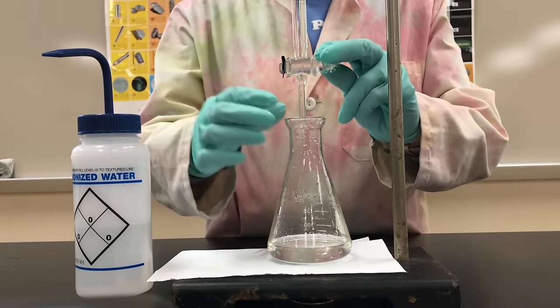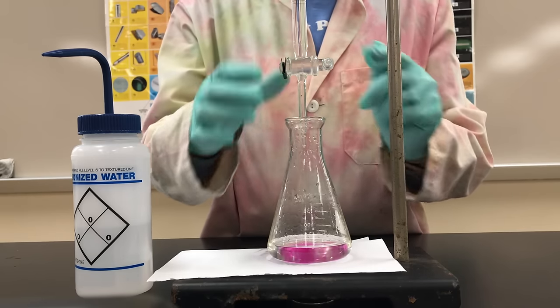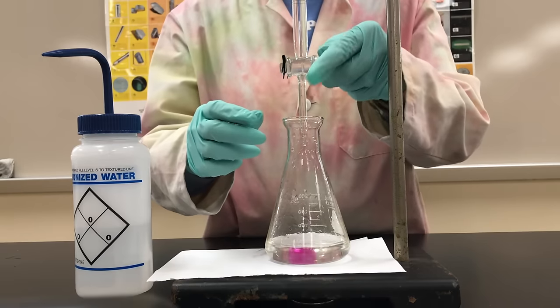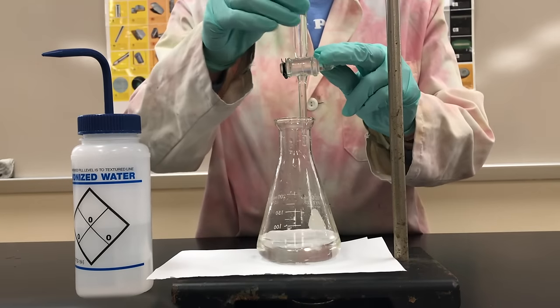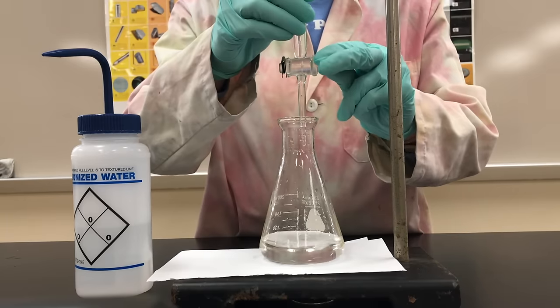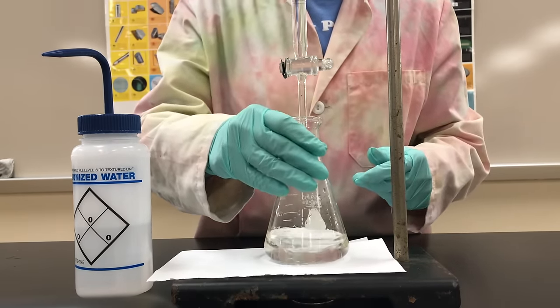Another technique that helps when you get closer to the end point is to do a 180 degree turn on the stopcock, then stop and swirl it so that you can see that the pink color is persisting longer. This will allow you to add very small amounts of solution at a time instead of just leaving that stopcock completely open and possibly missing the end point.